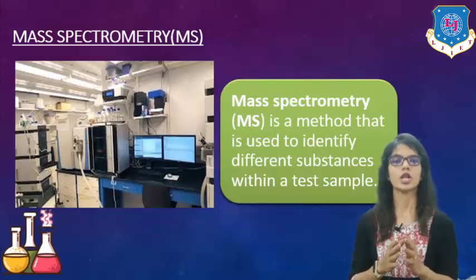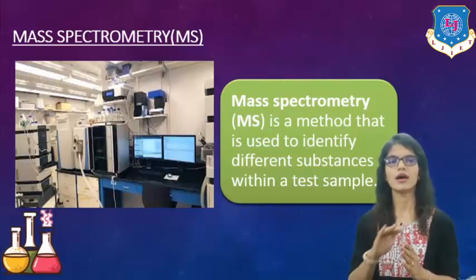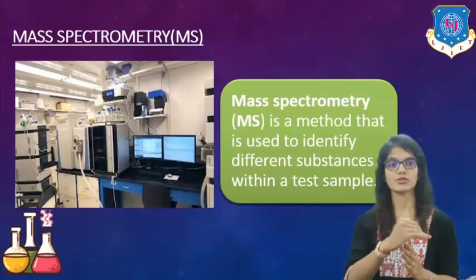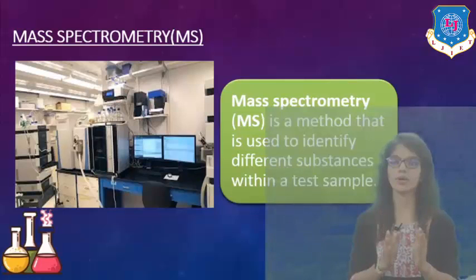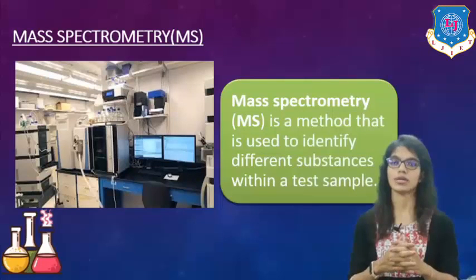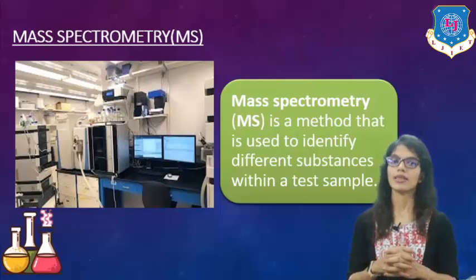Right? Here we will call our substance a sample, because each and every instrument handles the identified substance as a sample. It can be of any form. It can be a solid, a liquid, or a gaseous one. It can be semi-solid ones also. Okay? So depending upon that, we will utilize the analytical techniques here.